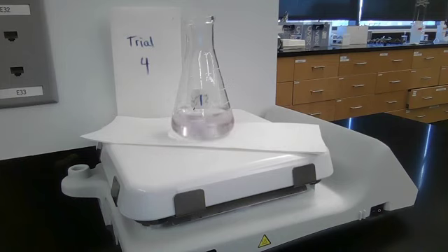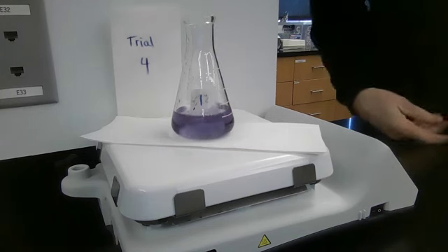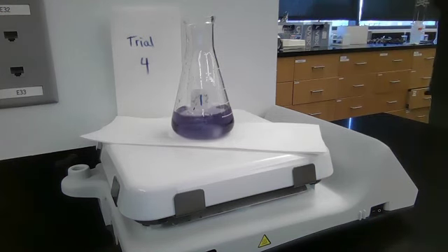Oh, there we go. Nice. At the first sign of blue. Yeah, that purple, that looks pretty good. This trial 4.